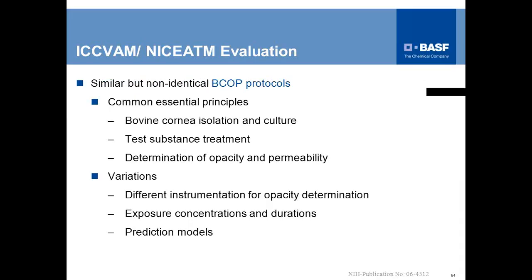So, talking about the protocols, I will not go into the very details here. This is just to summarize that there were some common principles in the assays. These included the isolation and culture of the corneas, as Hans has introduced to us just a couple of minutes ago.